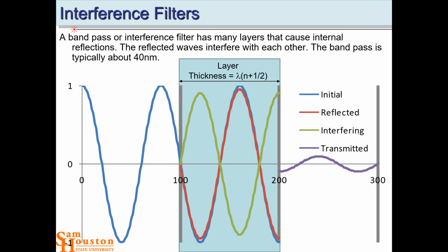Now, where does this energy go? Well, the thing about the interference filter is it's angle dependent. And so what this really does is it steers the transmitted beam off axis. So there will be angles through here at which there's constructive interference, and the beam actually gets brighter. Isn't that weird? Okay? So you would have angles where the beam is bright and angles where the beam is really, really dim. And so we want the normal, the straight path through to be the dimmest.